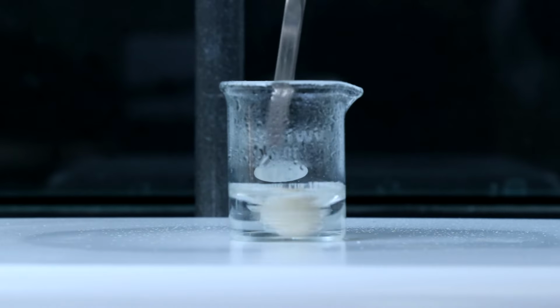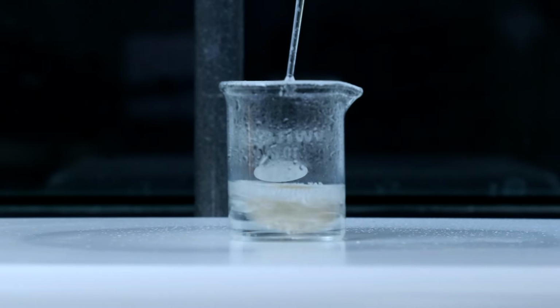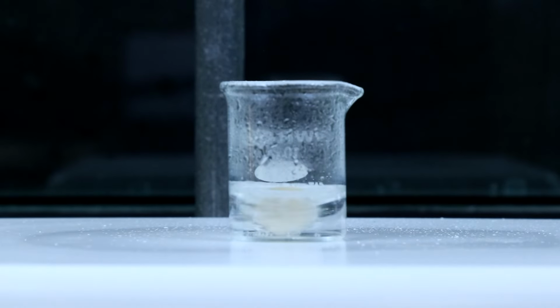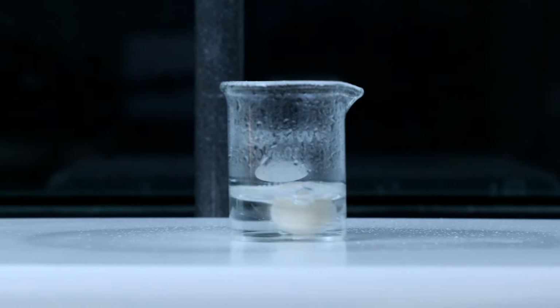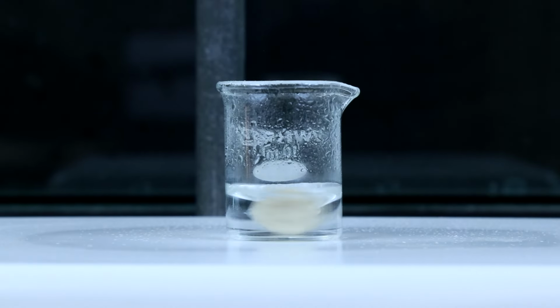After a little while, I'll go ahead and test the pH to see where we're at. And it's not quite acidic, so I'm going to keep adding the hydrochloric acid and keep spinning it until we see precipitate forming or the solution is fully acidic. At this point, I'm seeing fewer bubbles when I add the HCl, almost none, so I'm going to go ahead and test the pH again. This time it is acidic, but just in case, I'm going to allow the solution to spin for a while longer to make sure that the HCl has reacted with all of the base.